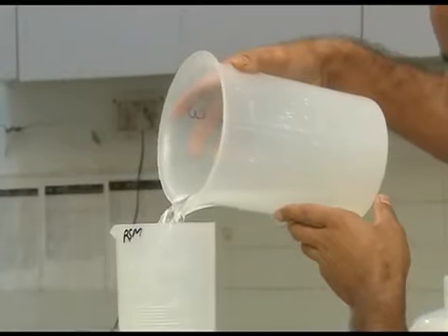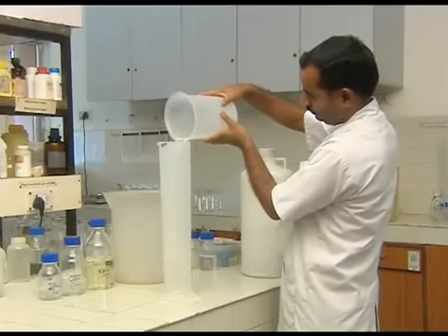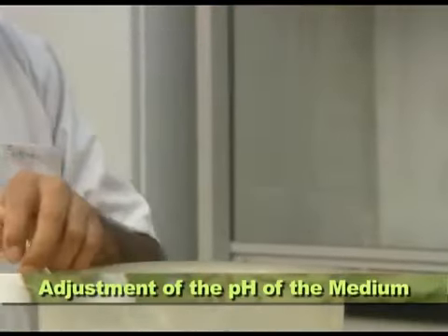Care has to be taken to avoid precipitation of salts, as it prevents the availability of salts to the plants. Thus, salts with higher solubility are first dissolved. Adjustment of the pH of the medium.